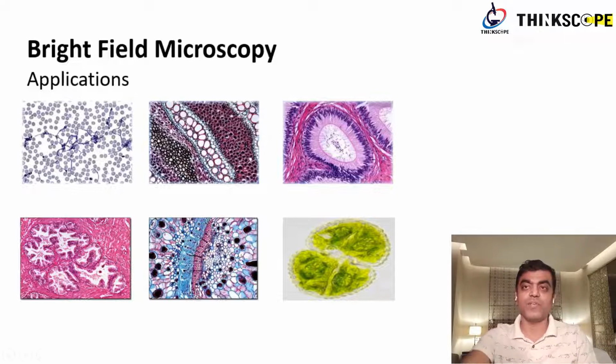So the first one, this is from the blood smear. You see different types of cells like RBCs, WBCs, and you can find what the different types of WBCs present are. For pathologists, for screening purposes, this is very commonly used, okay? It's like a lab next door to your house. You go there and you find a small microscope, they're working in Brightfield mode, okay?